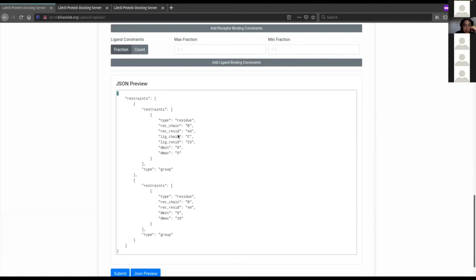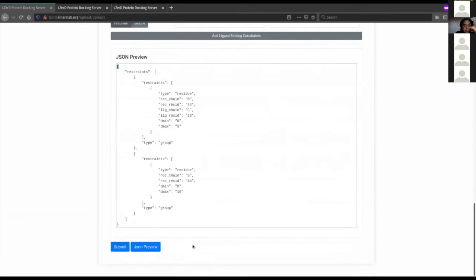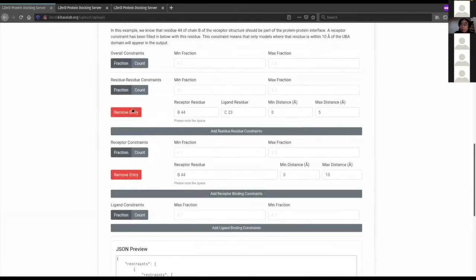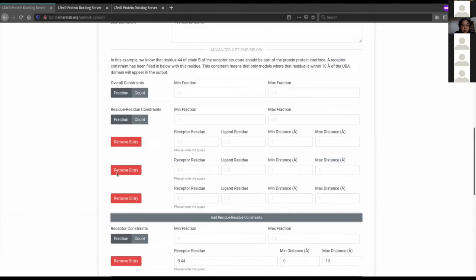There are also residue-residue constraints: if you have a very detailed mutation study you might know both sides of the interaction. You can specify that a particular residue on the receptor is forced to interact with a specific residue on the ligand. For example, B44 on the receptor and C23 on the ligand, with a very strict cutoff of 5 Angstroms. There are also overall fraction and count controls — these specify soft or Boolean conditional functions on restraints, so you can say that at least one or 80% of a group of constraints should be satisfied.